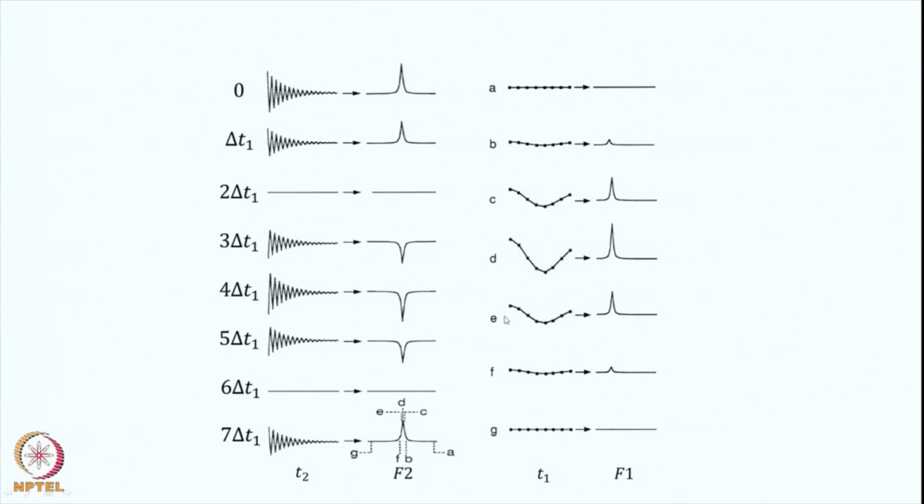Then you go to the E point, then it is decreasing, then you go to the F point further down, and you go to G, once again it is very down. So, what we have got here therefore? Therefore, this is also an FID, and like here, where the FID was going point by point, which was showing variation. These ones are also FIDs. These FIDs are different depending upon which portion of this frequency spectrum you are looking at.